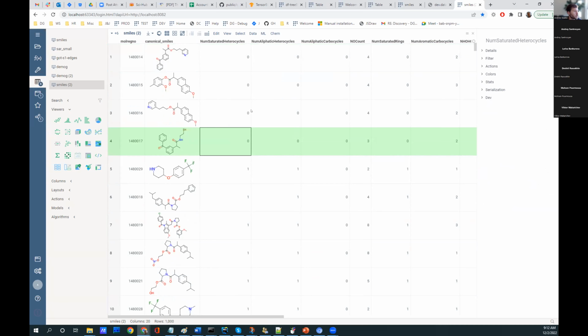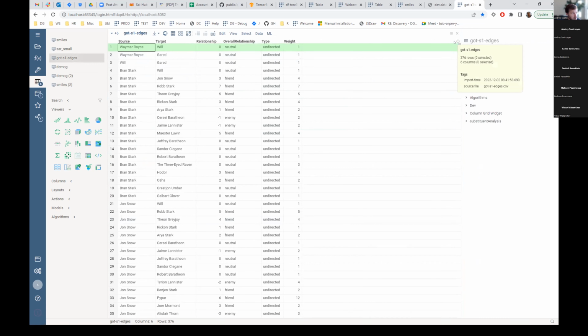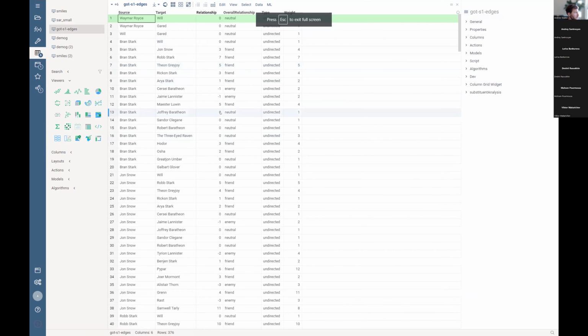Right. Any questions regarding the frozen rows and columns? Okay. Moving on. Now I will give an update on some of our visualization capabilities, and we've made good progress on visualizing hierarchical and linked data. And later on, we will show even more interesting functionality. But at the moment, let's see how we can visualize linked data.